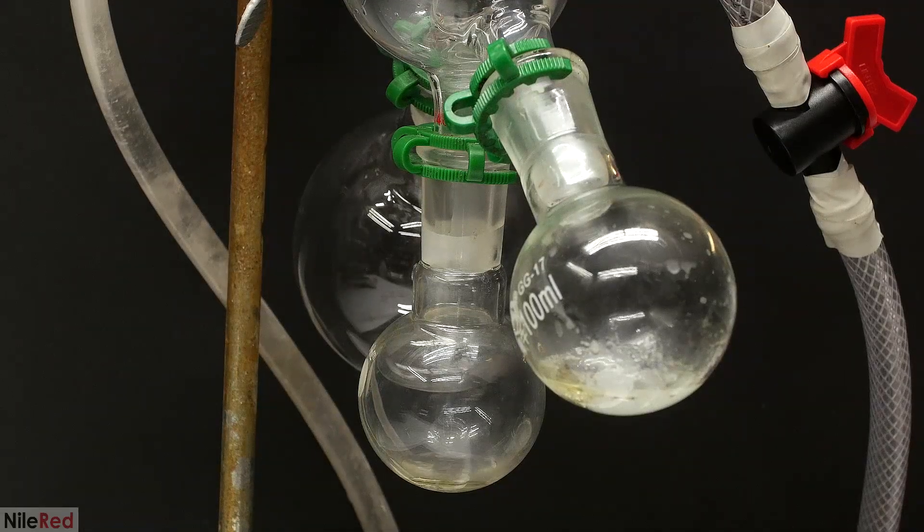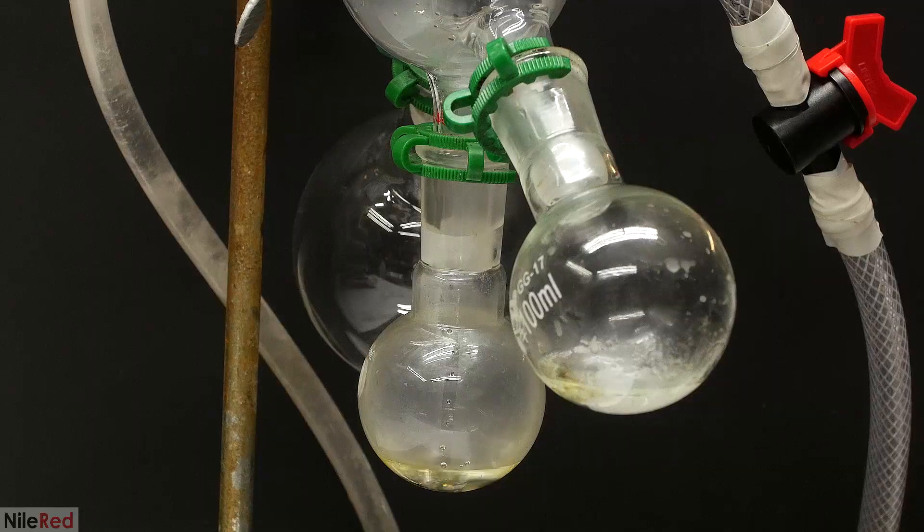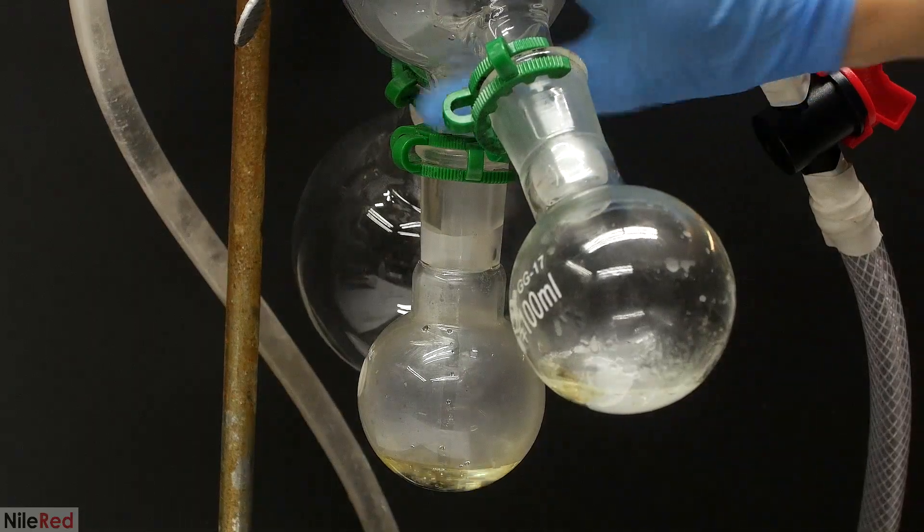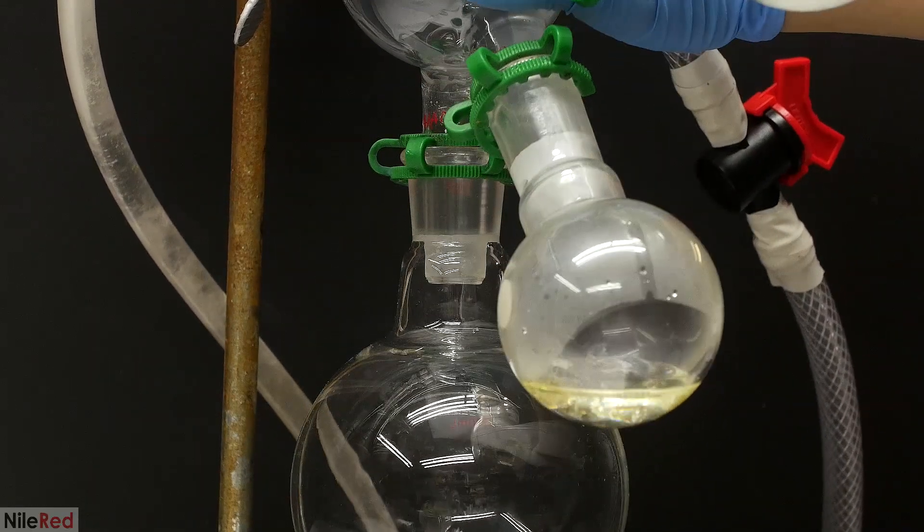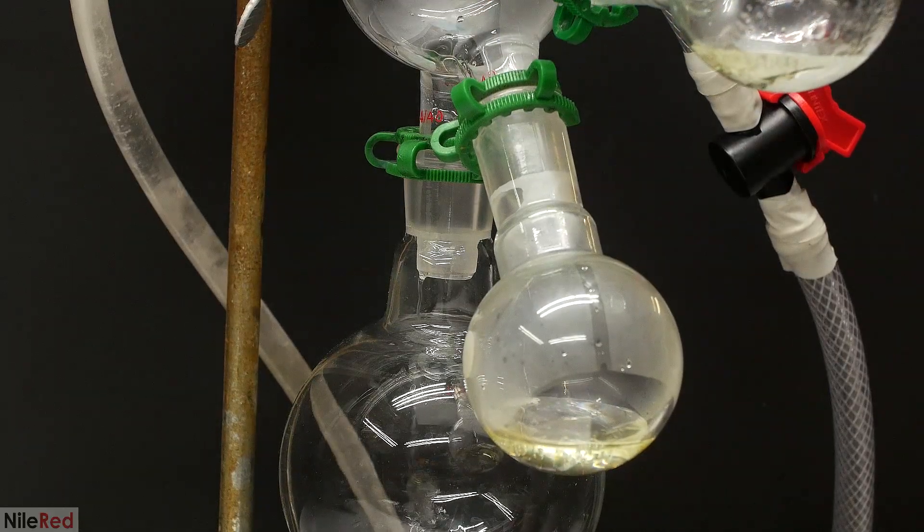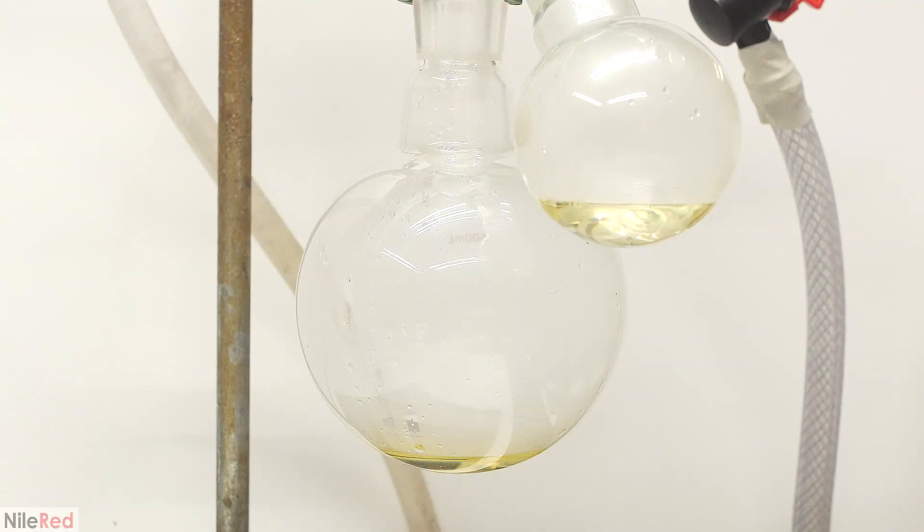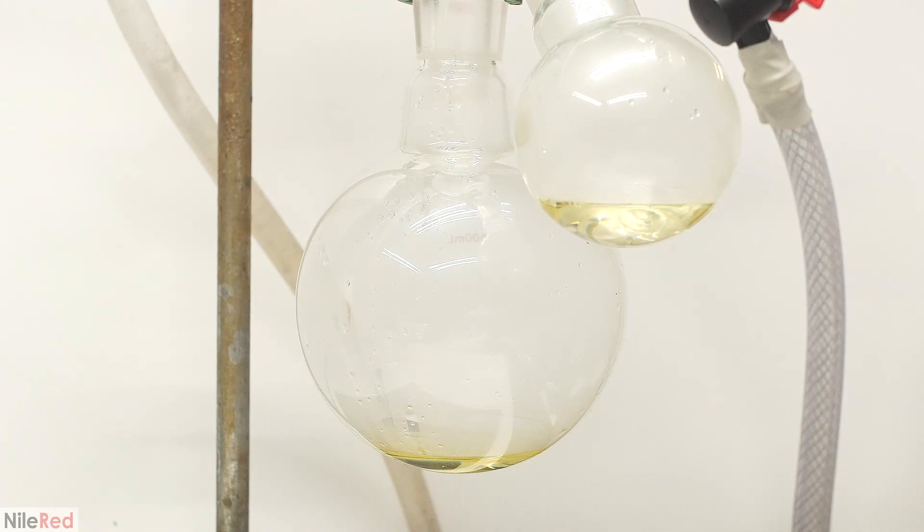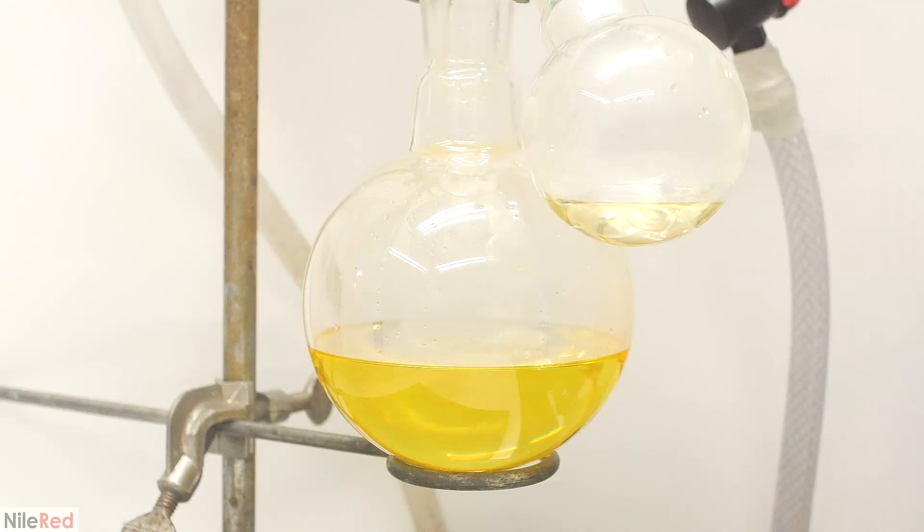I continue collecting things in the middle flask, until I'm sure there's no more water coming over. When I think it looks good and water-free, I turn it again to collect everything in the large one. It's now just a matter of waiting until everything distills over. It's eventually done when there's only a small amount left in the distillation flask.